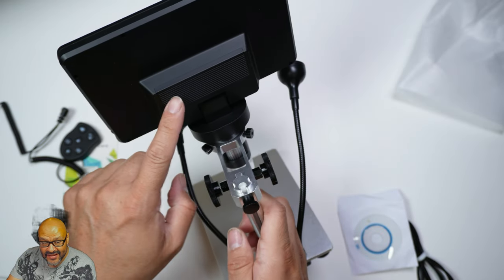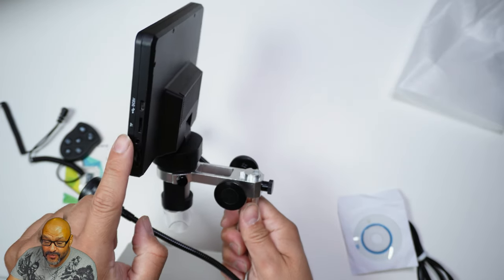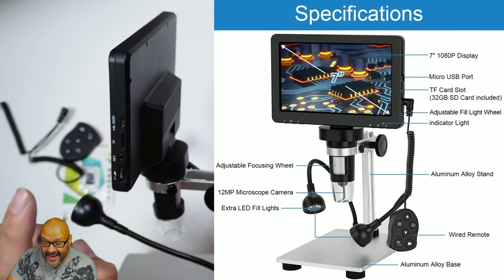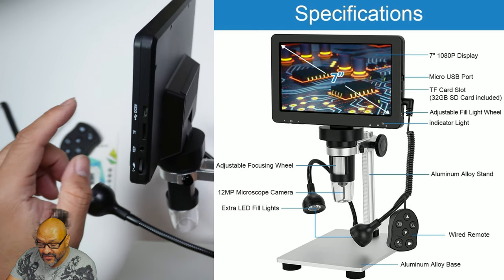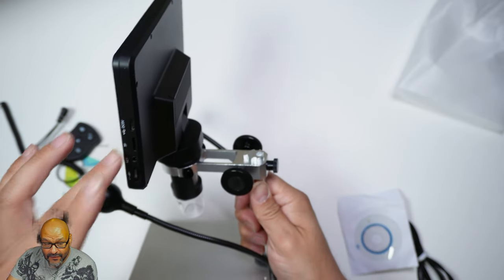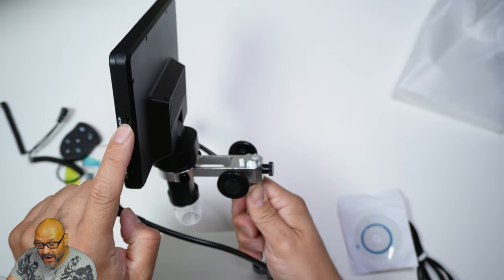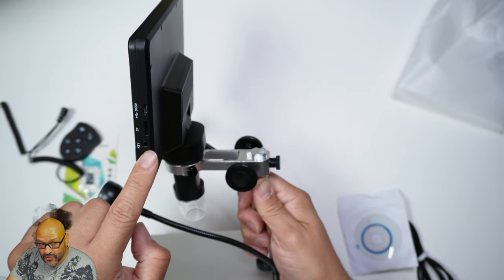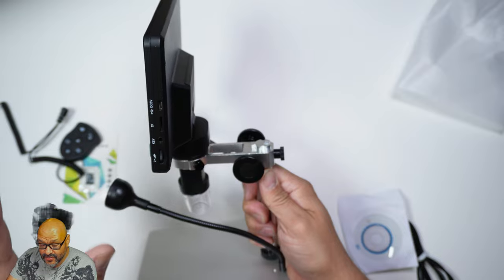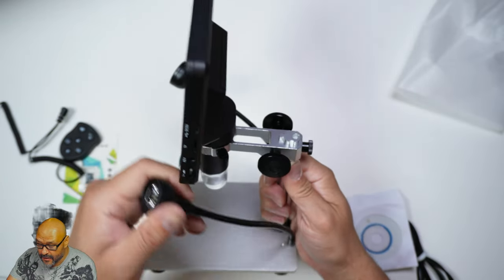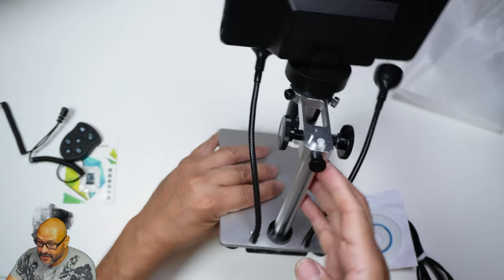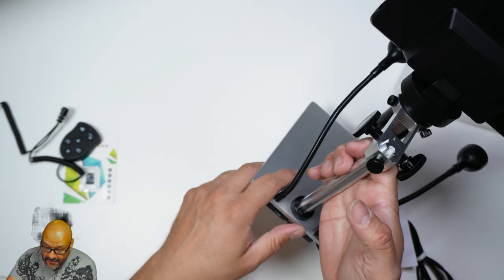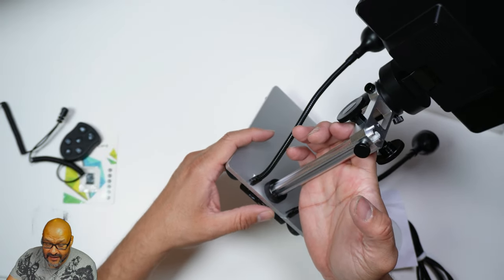Just to let you know, this is the actual screen. This is where you put the memory card in here and also the connection too. Just be aware that both connections - the key, the power, and the control - have to be connected to this unit itself. That will automatically give you power for the system on the top. On the bottom, you're going to require additional power.